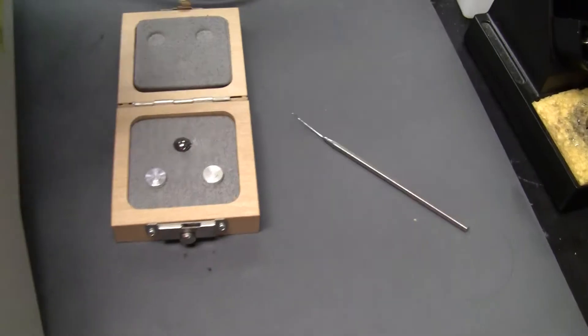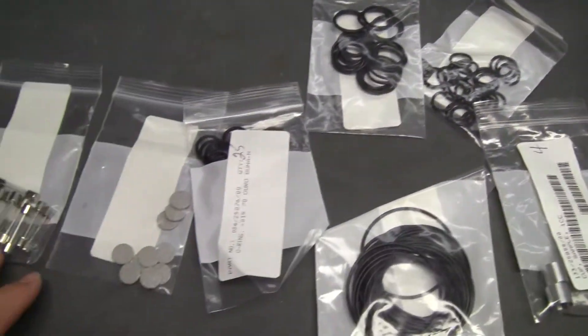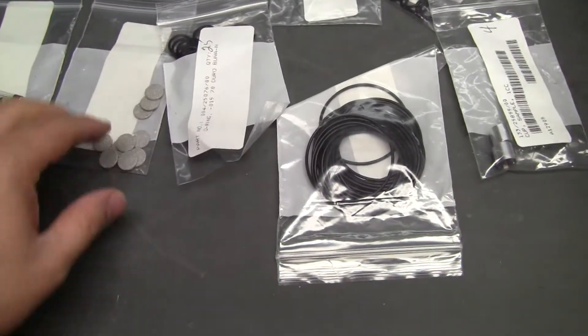It comes with a calibration ball, accessories, gaskets, seals, fuses, and looks like spargers.